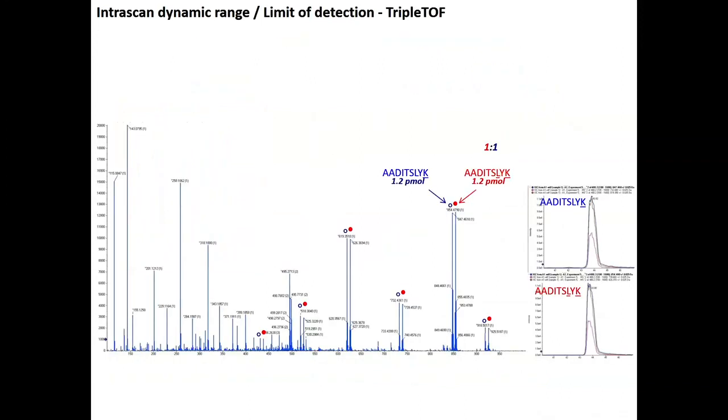So just to show you what it really represents in terms of raw data, this is the MSMS spectra of the apex of that peak here, of this experiment.